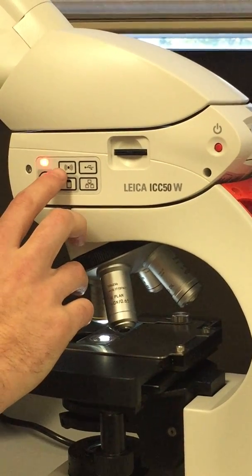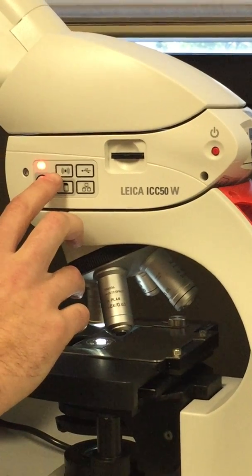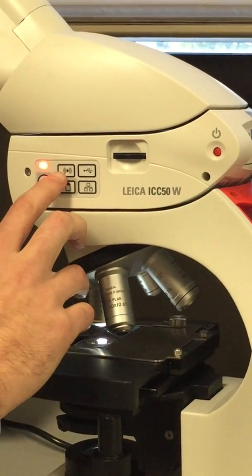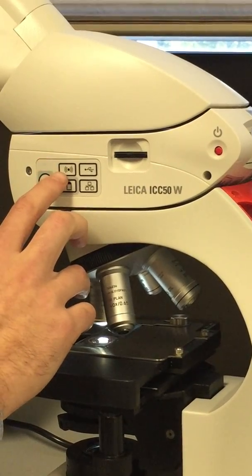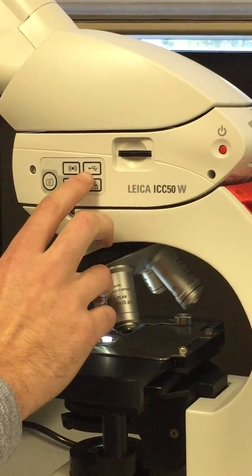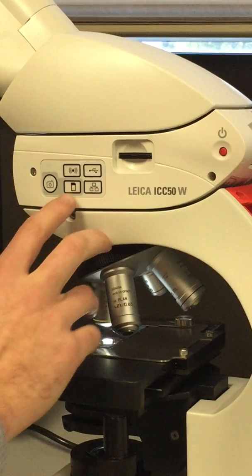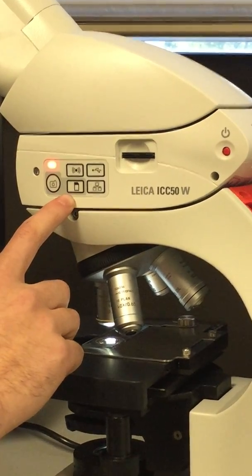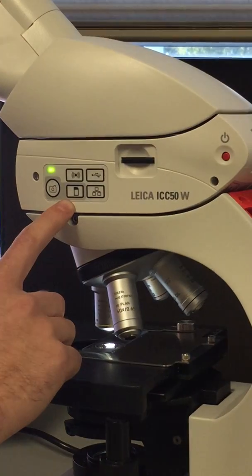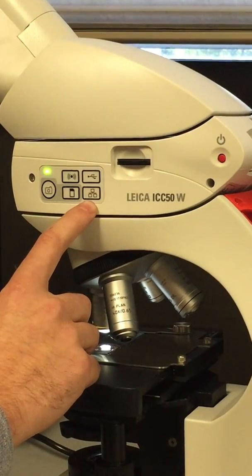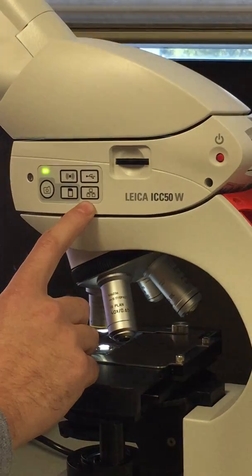The first output method is Wi-Fi, and you can output wirelessly to a device, such as an iPhone or Android device, or a computer. The second option is USB, where you directly connect the USB cable to your computer. The third option is HDMI mode, where you connect to a monitor or projector via HDMI cable. And the fourth mode is network mode, where you can connect over your internet network.